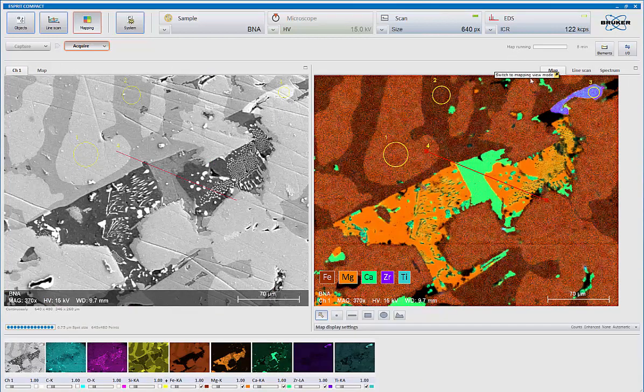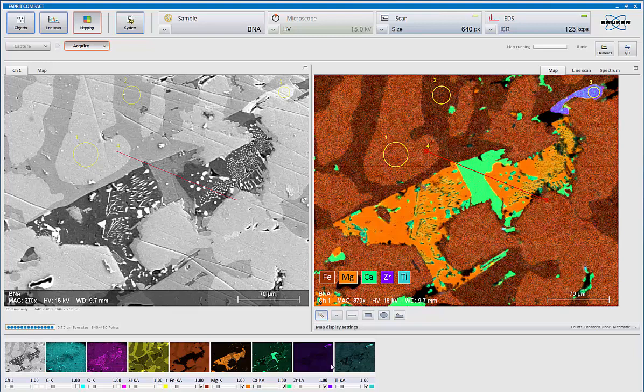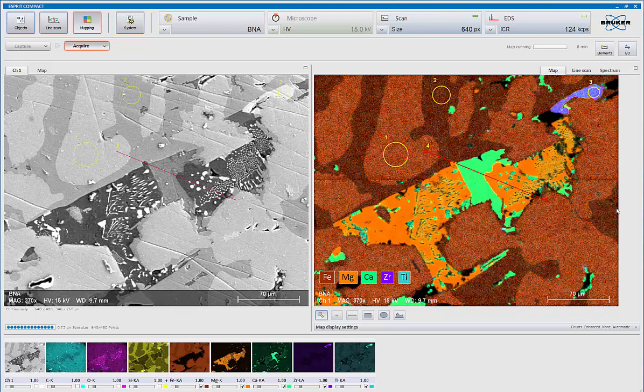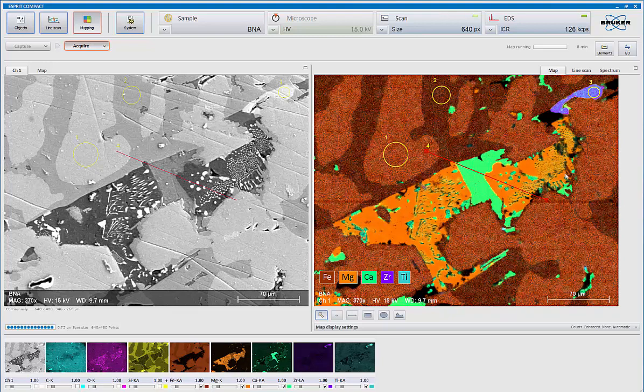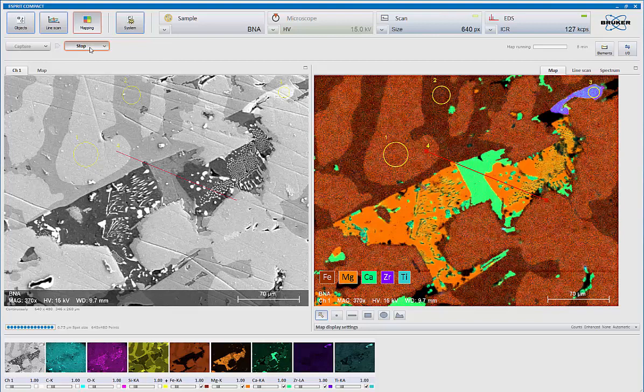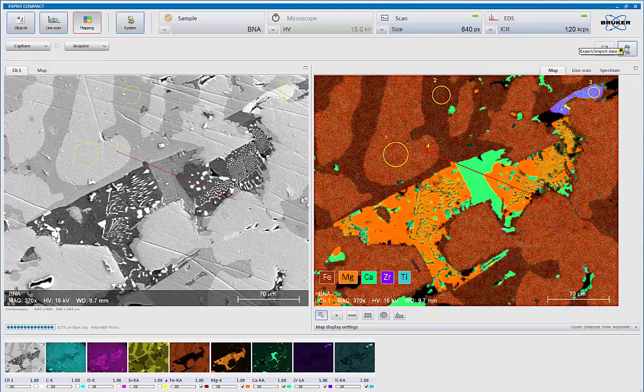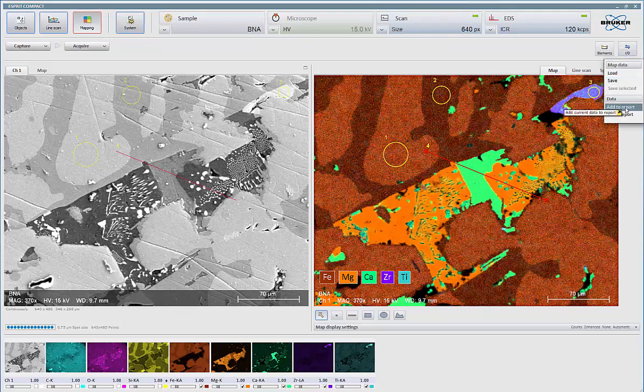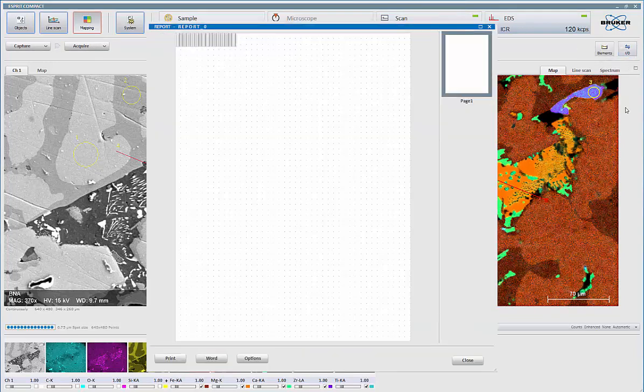So one collection, we've got elemental maps, spectrum, and line scans at any time. Once I'm satisfied with my statistics, and in this mode, since I'm running manually, I can stop the acquisition simply by clicking stop. And now if I want, I can put this into my report simply by coming up here and saying add to report.